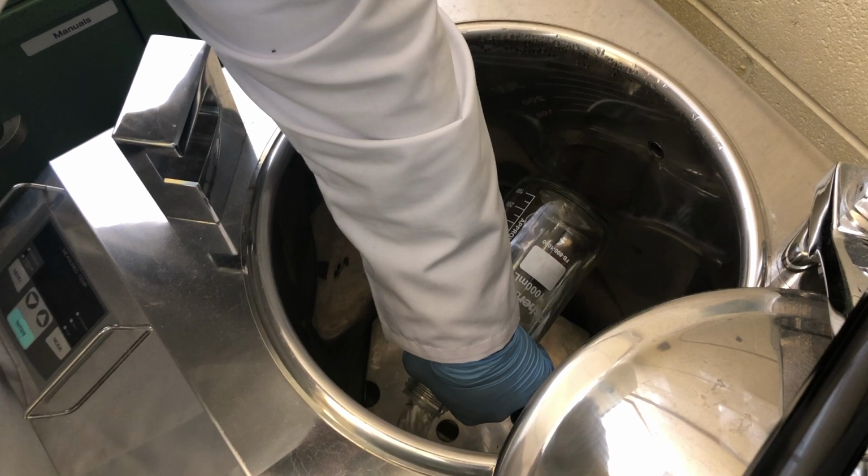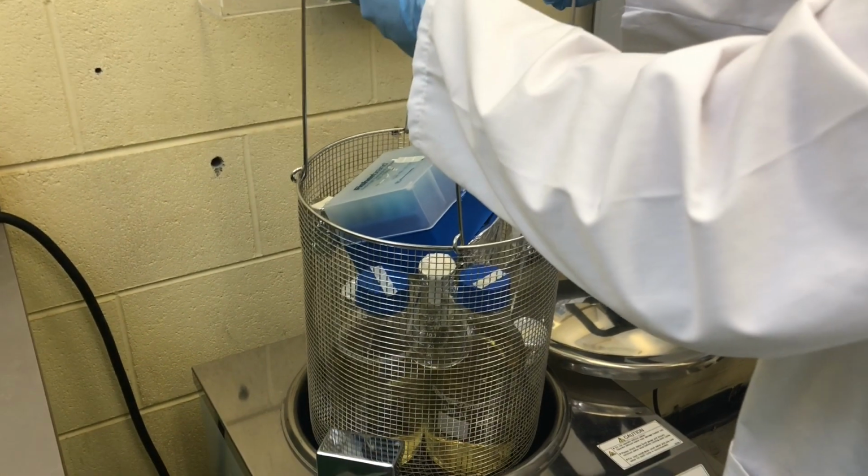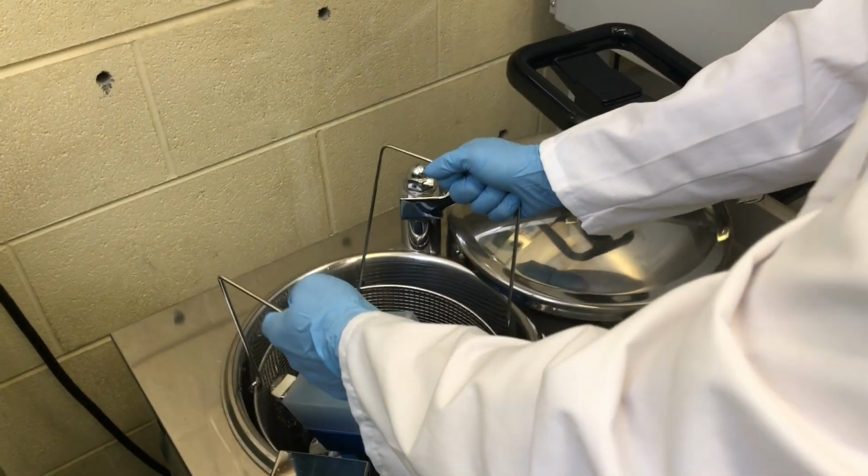To operate the autoclave, make sure there is a sufficient amount of water inside. Fill each basket with the items needed to be sterilized, making sure all are taped and covered with foil. Next, carefully place the basket in the autoclave, replace the lid, and hit start.